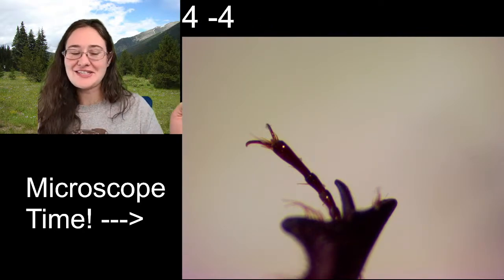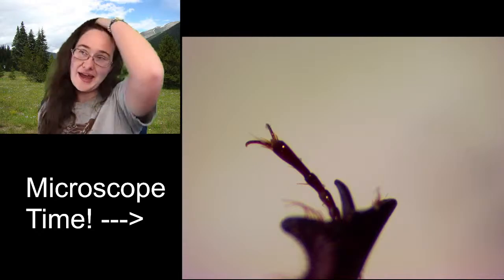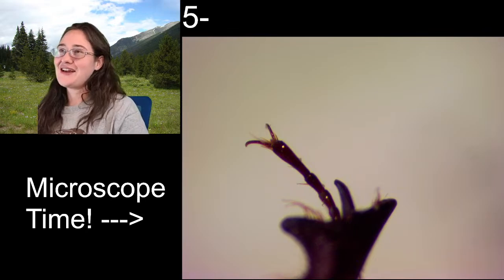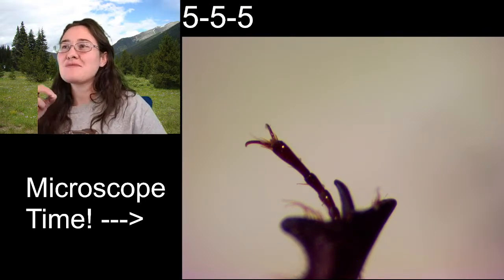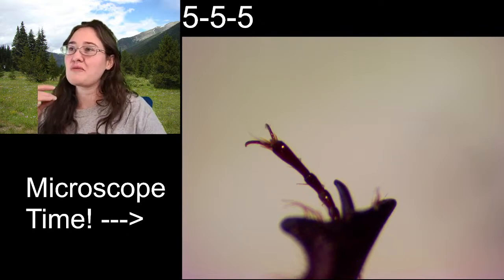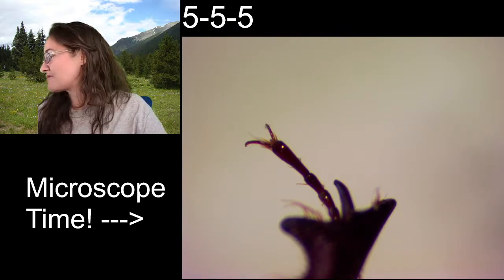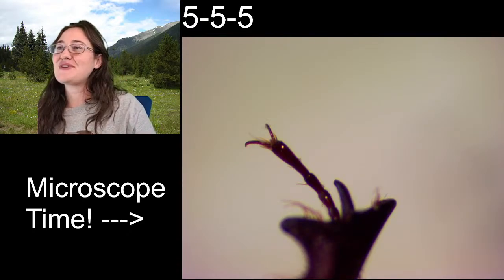I really did. And when we looked at the first leg and we counted four, I confirmed that in my head. In reality, you're going to have to change this if you wrote it down. Dung beetles have five tarsal segments. They have a 5-5-5 tarsal formula, except that when we're looking at this front leg, I think we actually have to flip the leg upside down to see the first segment because it's very, very small.